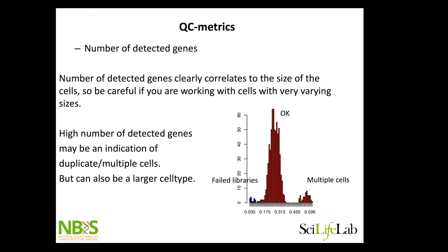How many genes do we detect per cell? The issue is that it clearly correlates with the size of the cells. So if we have a homogeneous population and you have a really high number of genes in certain libraries, they are most likely doublets. In fact, in one experiment they pooled 10 cells on the same Smart-seq2 plate and you see a really distinct pattern of doublets or multiples. And if you have very few detected genes, it's most likely a failed library. So I would remove both the high and low end if I have a homogeneous sample.